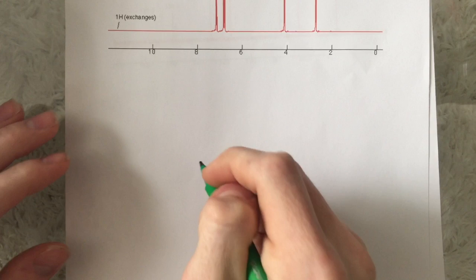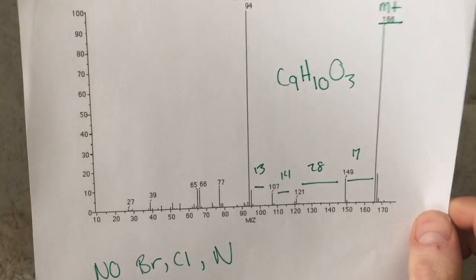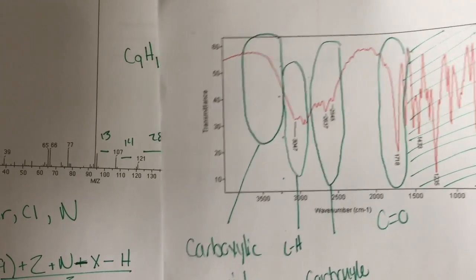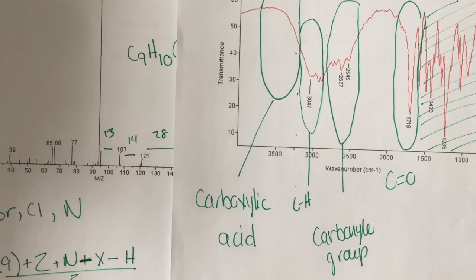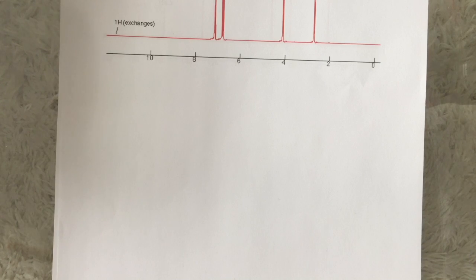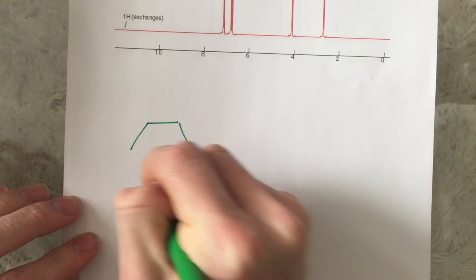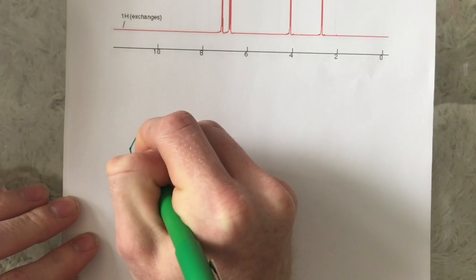So we're going to come up with a structure, and looking back at the mass spec diagram and looking here, we know that sometimes with the carbonyl groups or the aromatic areas in the IR, we can put together a structure starting off with a benzene ring, which would eliminate quite a few of the carbons that we know are present.